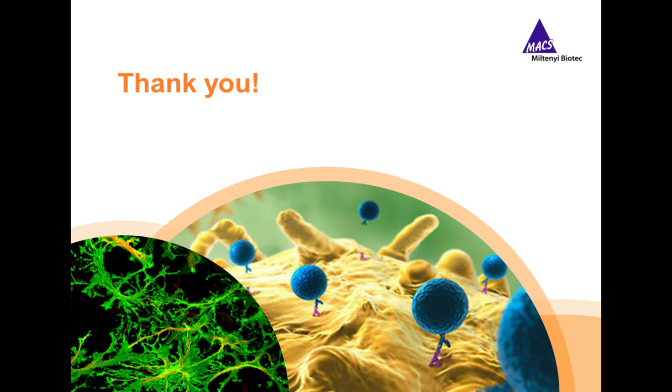Great, thank you. Okay, your next question is, when will you choose to use ACSA-2 antibody, and when will you choose GLAST antibody for astrocyte staining? That really depends. Both were shown to express on the majority of astrocytes in principle. We checked co-expression of both markers with other common astrocyte-specific antibodies, and we saw that in all cases they detected the astrocytes that were positive for other markers like GFAP, S100 beta, glutamine synthetase, and so on. So both are suited to detect astrocytes.